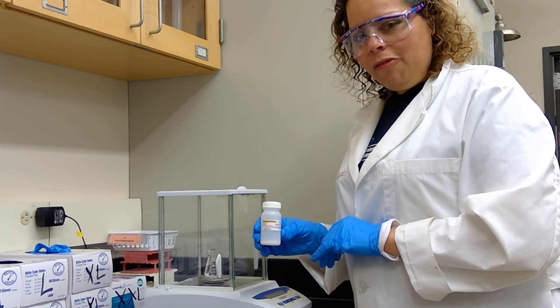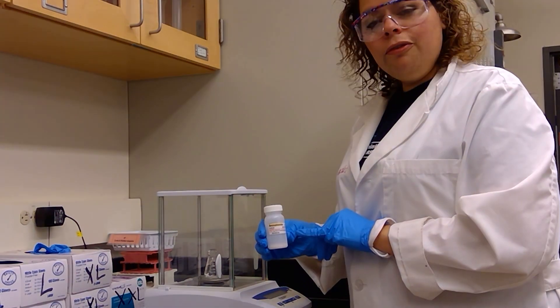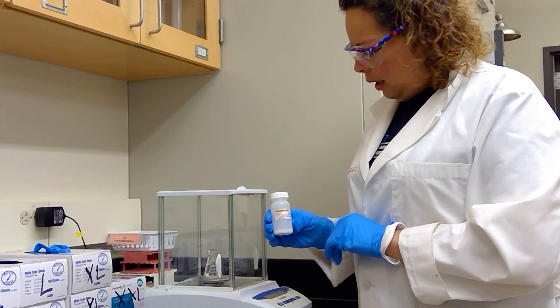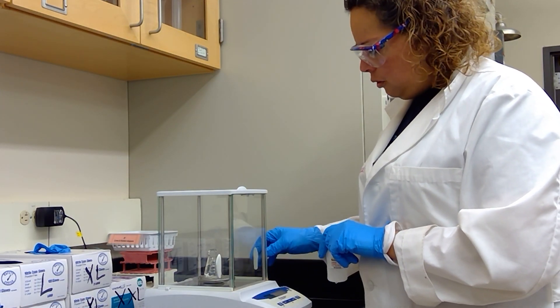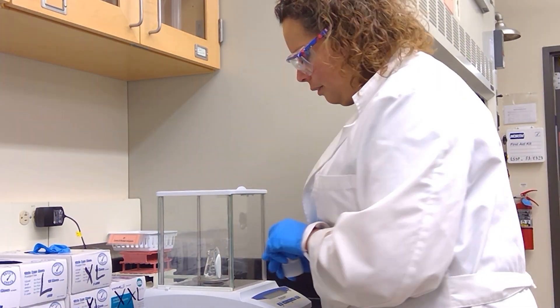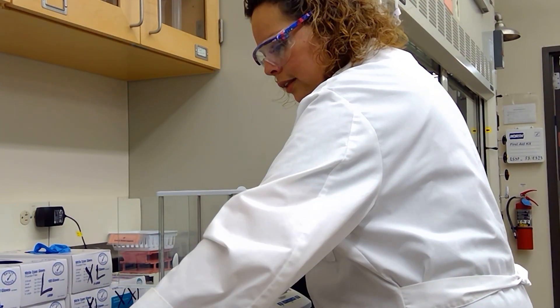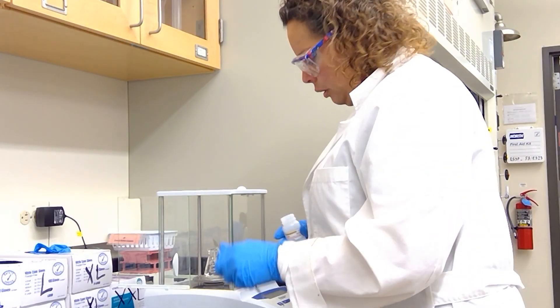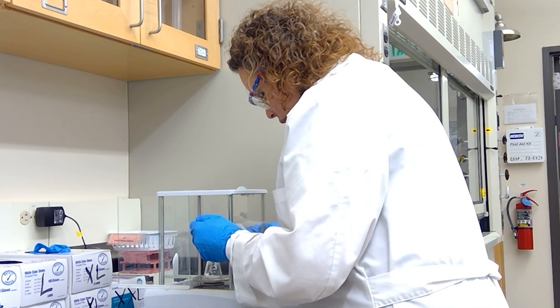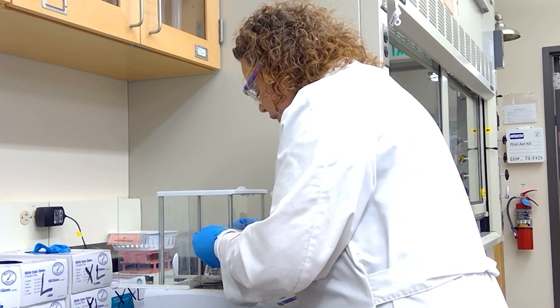We are starting off by weighing out 250 milligrams of benzophenone, and I'm going to measure that directly into my 25 milliliter Erlenmeyer flask. 250 milligrams is 0.25 grams. I'm going to try to get as close as I can to that amount.